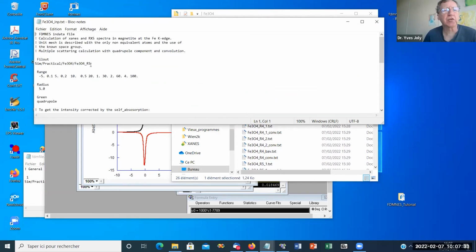Here we had calculated, so I go back to a smaller radius to go faster.